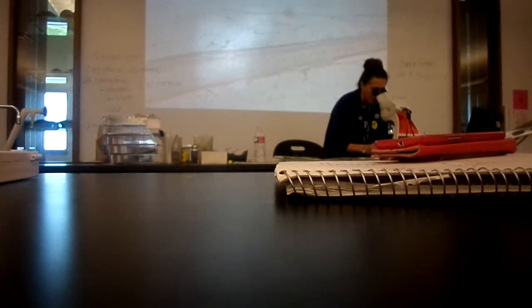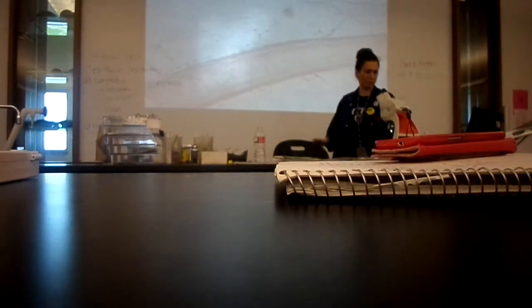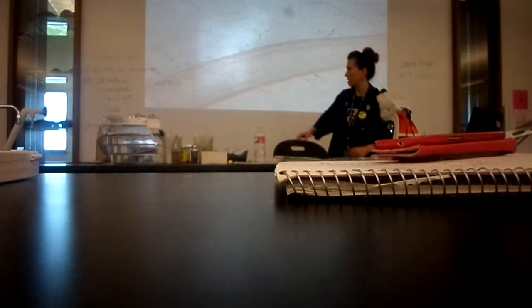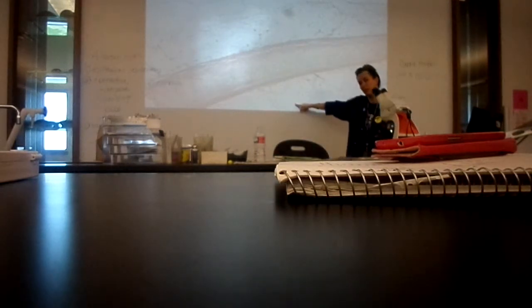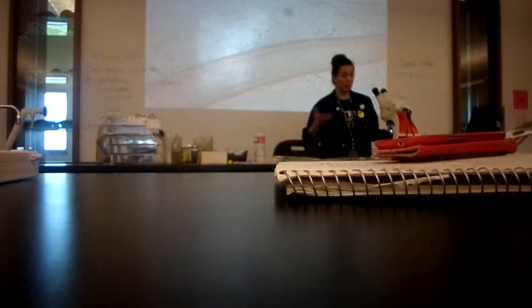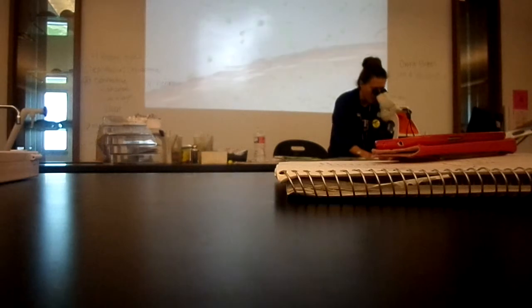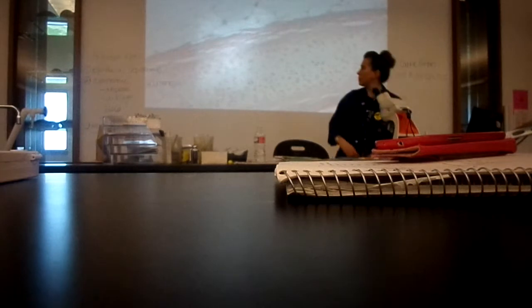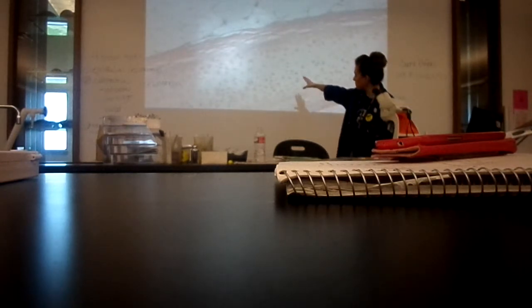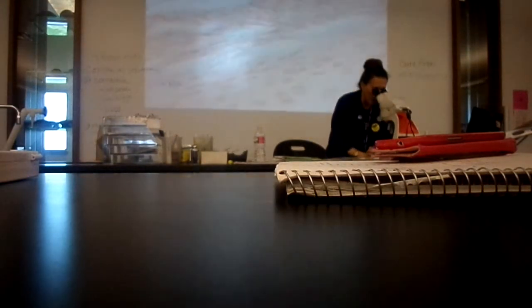What is cartilage? What we want to look at is this middle layer right here. Now I want you to notice what kind of tissue is up here and what kind of tissue is down here. It's more adipose. We've got adipose everywhere, even in places we don't want it. Adipose is fat. So we want to focus in on this ribbon that's running through the fat tissue on either side. I'm going to go up on a high power so we can find that one little area of that ribbon.